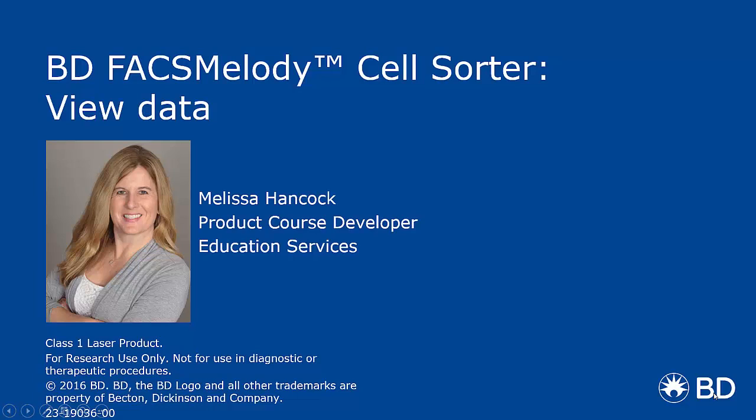Hi, my name is Melissa Hancock. Welcome to the BD FACSMelody View Data Tutorial. This is the second tab of the experiment workflow in BD FACSMelody software.